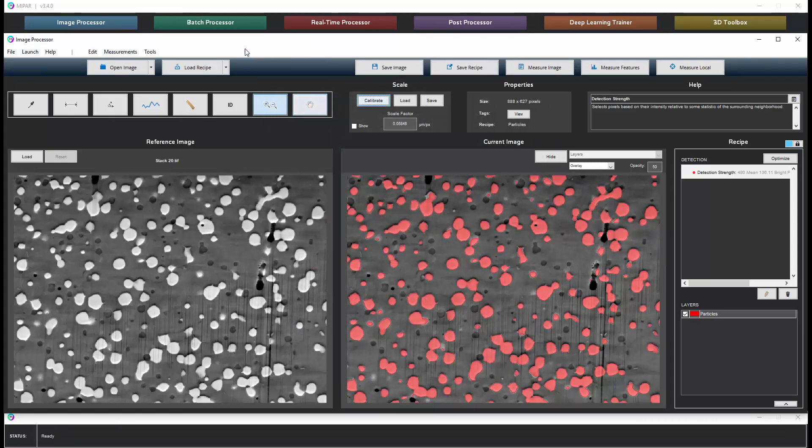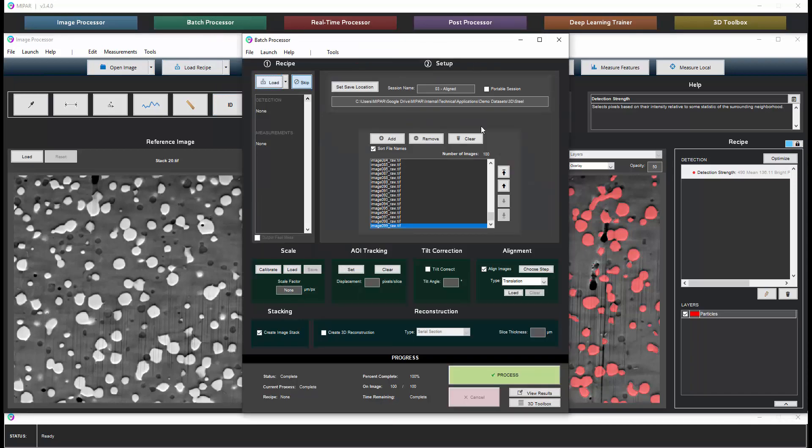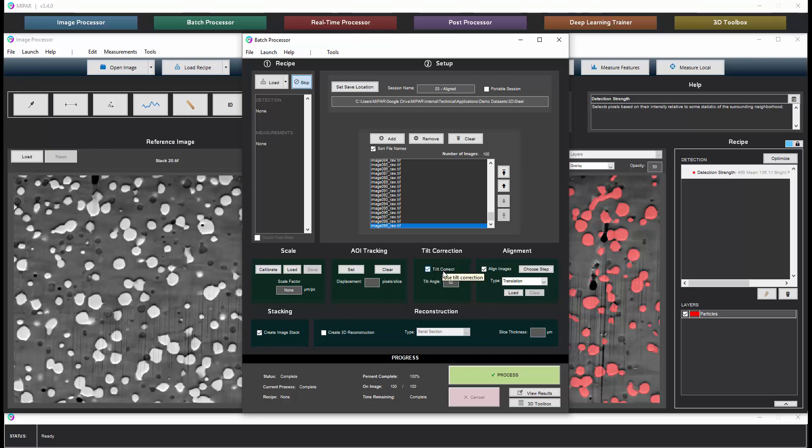I should note briefly that when processing some dual beam FIB data sets they may require tilt correction depending on how the sample was oriented during serial sectioning. If that's necessary during the alignment stage you can check off tilt correct. It will pre-populate with 52 degrees since that's the most common inclination that samples have when being serial sectioned in a dual beam FIB. And this will then tilt correct the samples, the slices in the Y direction, to account for the tilt. And that correction will be present in the aligned stack that was output before.